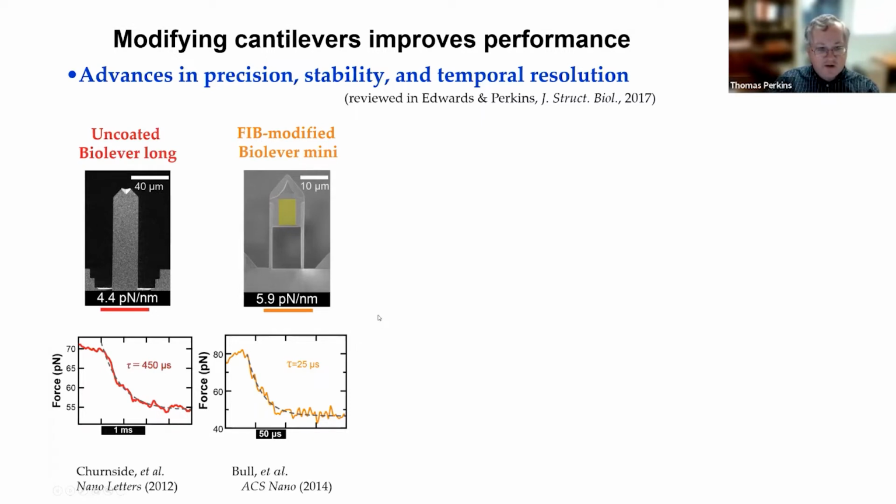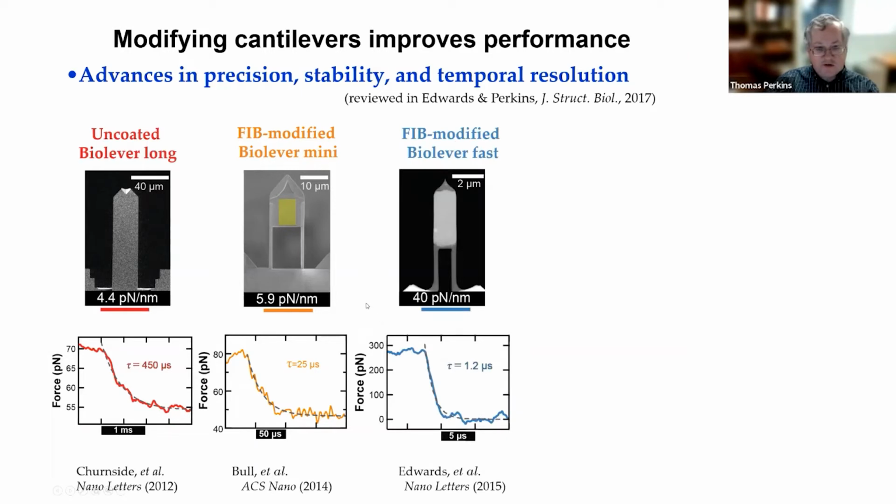So 40 microns, we went down to 9 microns. These are so-called modified biolever fasts. These are just 2 microns wide. Now, these cantilevers have exceptional time resolution in liquid, just 1 microsecond, but they suffered reduced force stability.